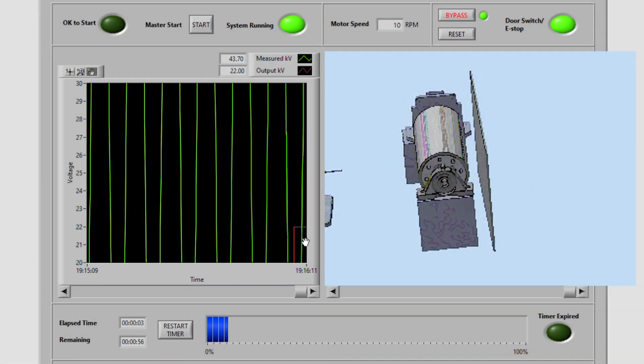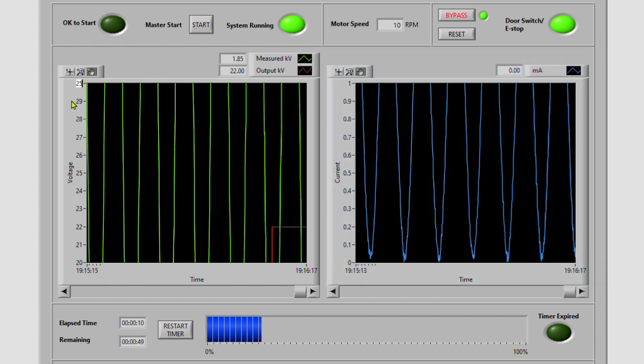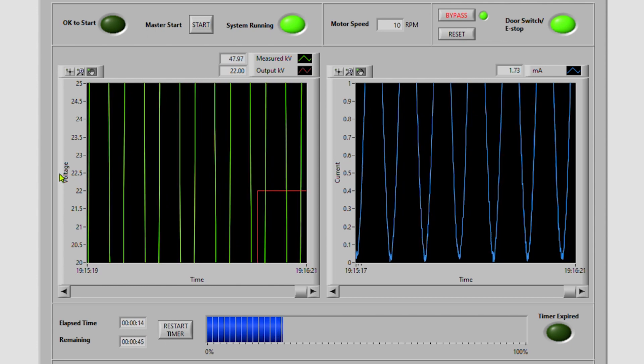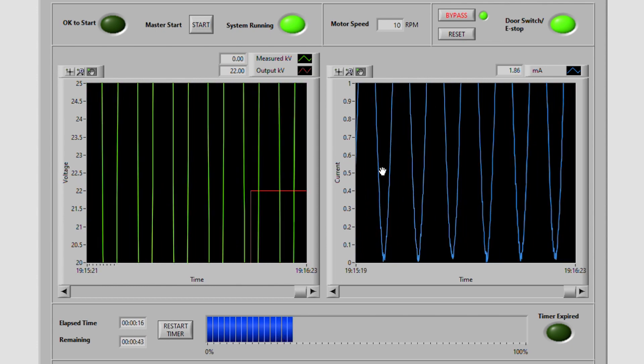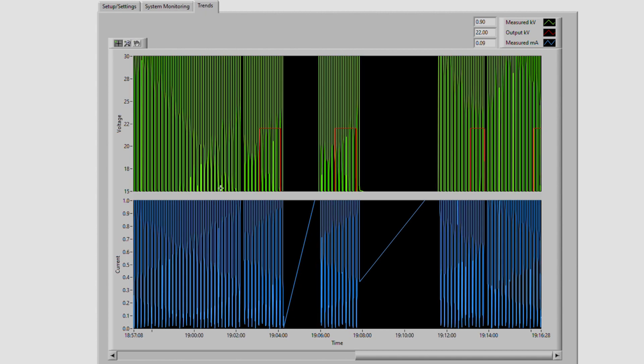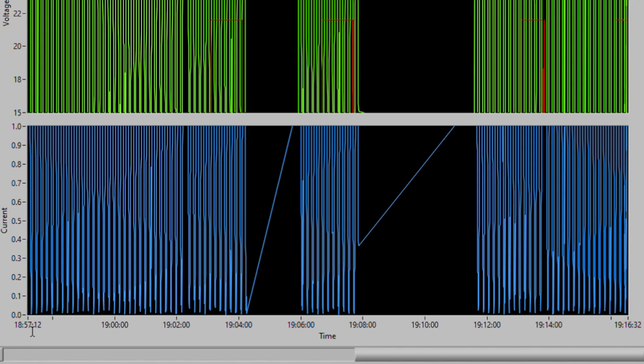Notice the step change. We can adjust parameters on the trends. On the left, we have real-time voltage monitoring. On the right, current. On the second page, we have the same trends but on a longer term — this one is currently set for 20 minutes.